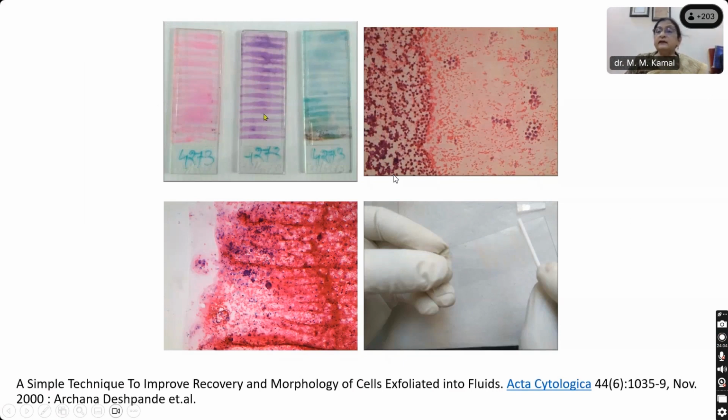This is the thick and thin method. I think this method has been indigenously developed in our department in GMC Nagpur, and ever since we have been using this. We do not make tongue-shaped smears. We do have cytospins, but this is the commonest method we do.